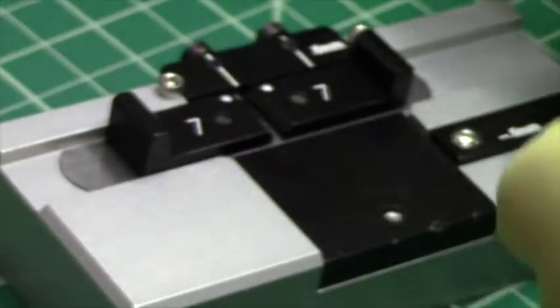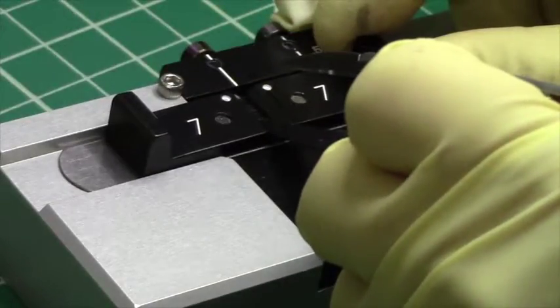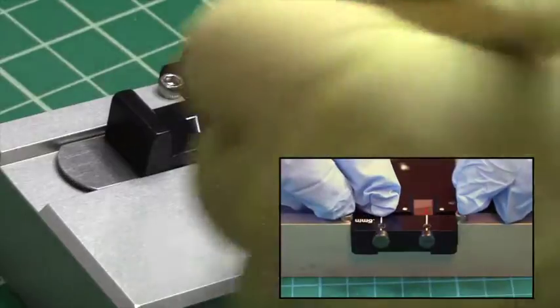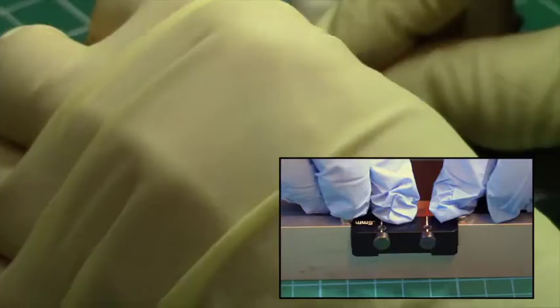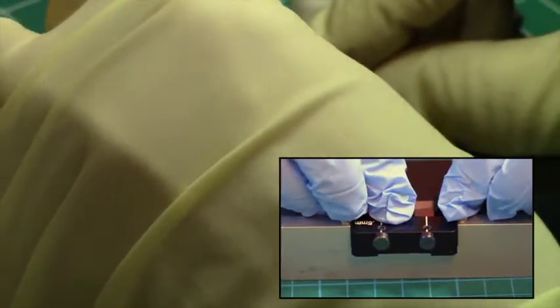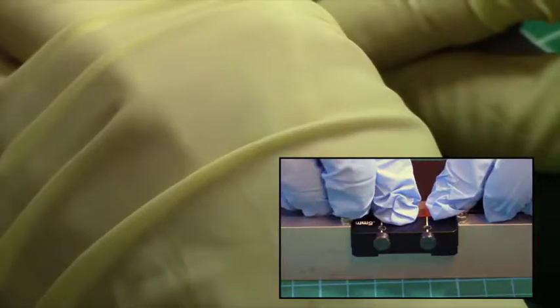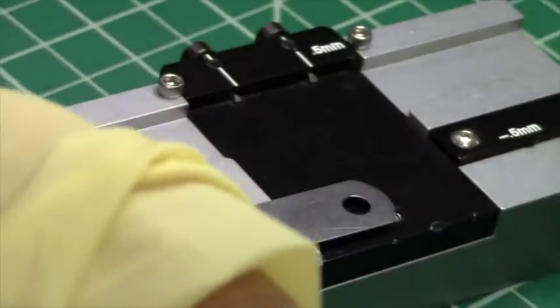I'm positioning the sample and going to push it up over the pin, then push on the white dots to cleave. And now I have cleaved the previous sample in half.